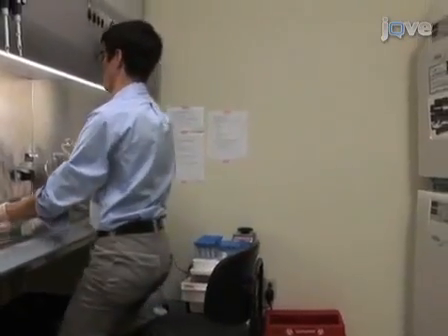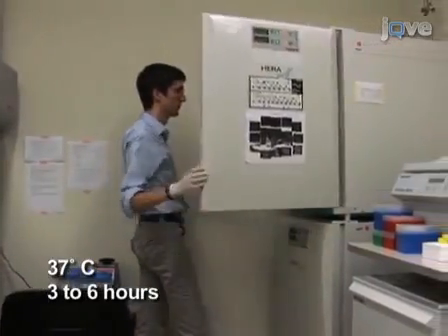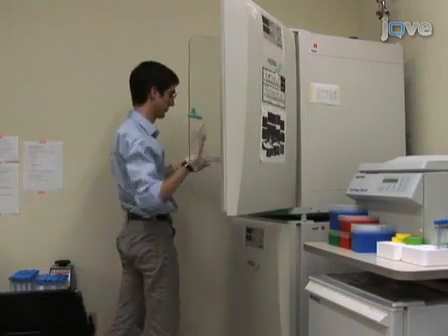Place dishes in a 37 degrees Celsius incubator for 3 to 6 hours before performing intranuclear microinjections to allow sufficient time for cells to adhere to the bottom of dishes.